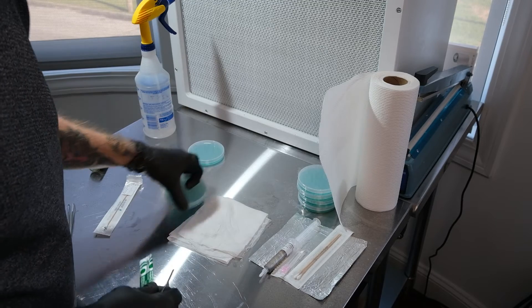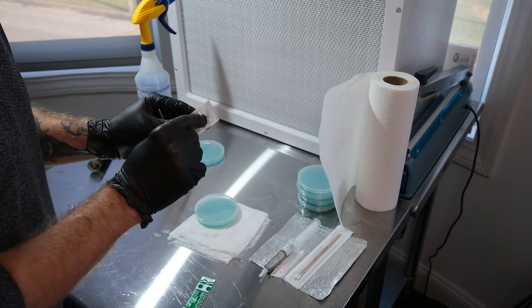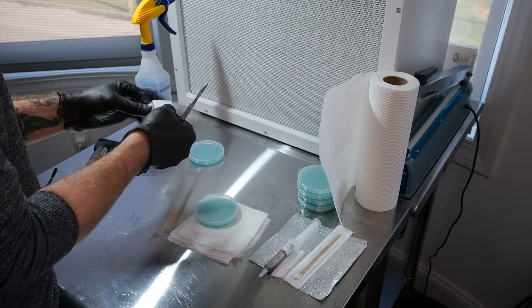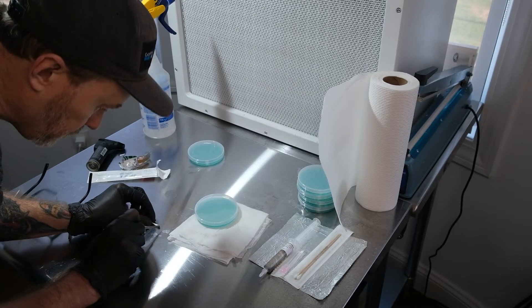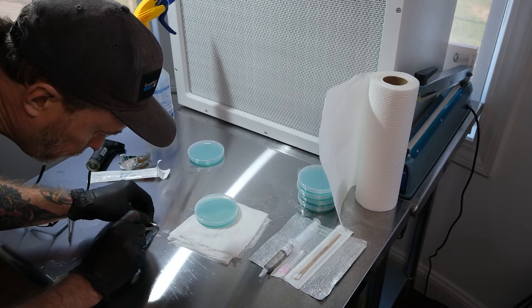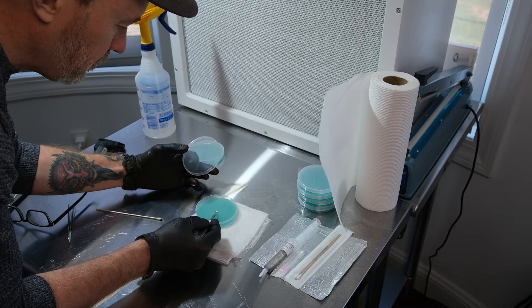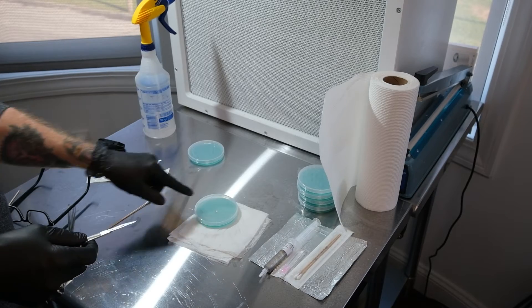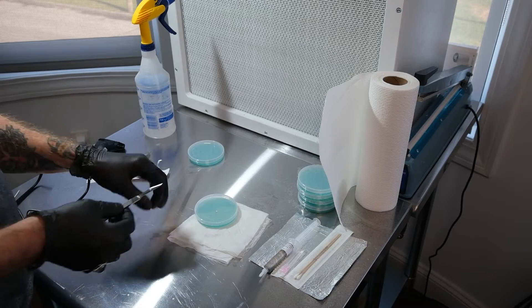Another way to use a swab — and a lot of people swear by this method — is to slice a piece of the swab off where the spores are and just place it on the plate. Take your sterile scalpel, slice a little bit of the swab tip off, and place it right there. So those are the two ways to use a spore swab: you can streak it, or you can slice it off. Some people even throw the whole Q-tip in there, but I wouldn't really recommend that.